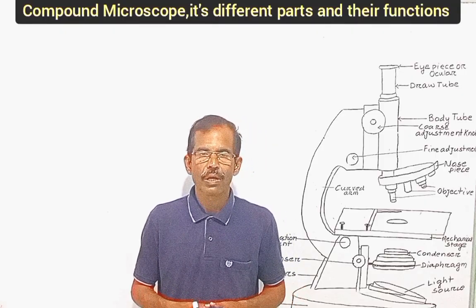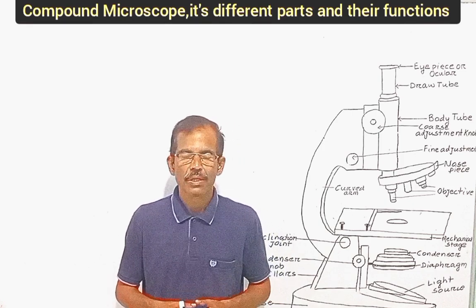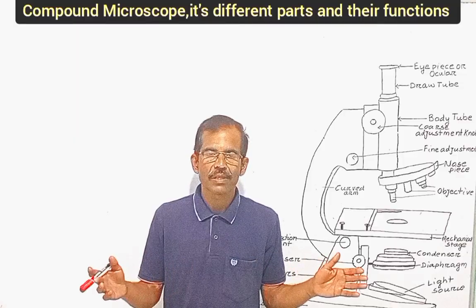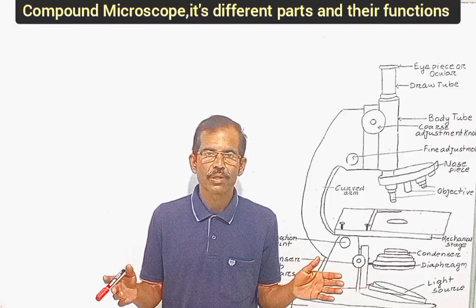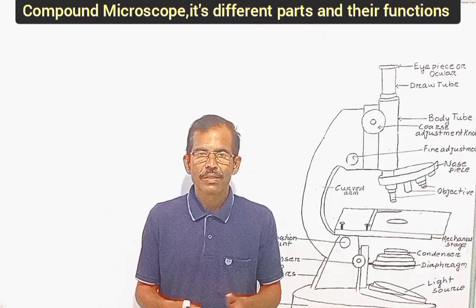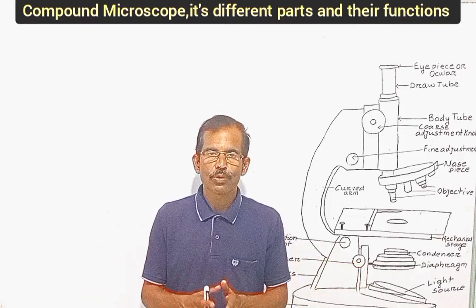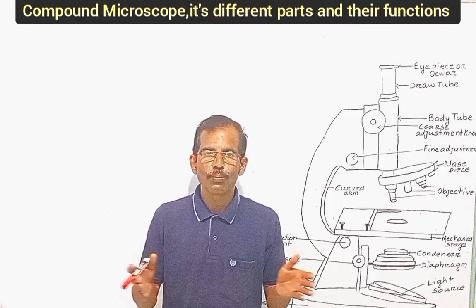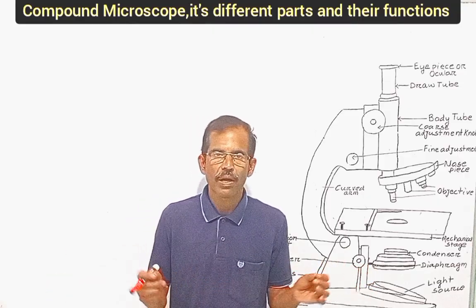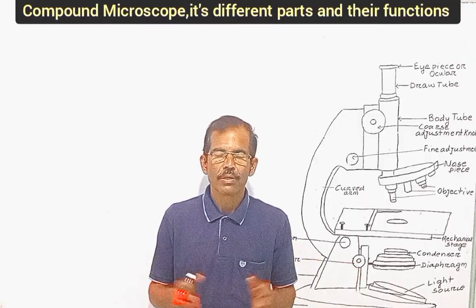First of all, let us know what a compound microscope is. A microscope that uses multiple lenses for higher magnification is known as a compound microscope. As already said in the previous video, a microscope has two major characteristics. Number one, magnifying power, and number two, resolving power.